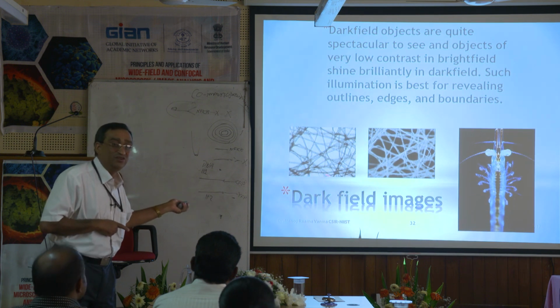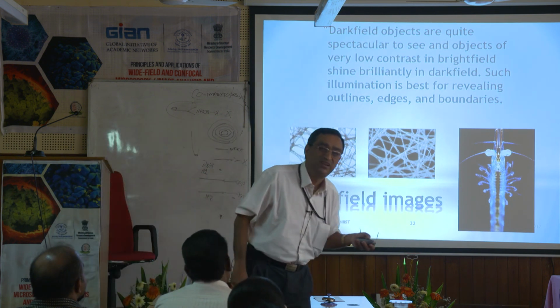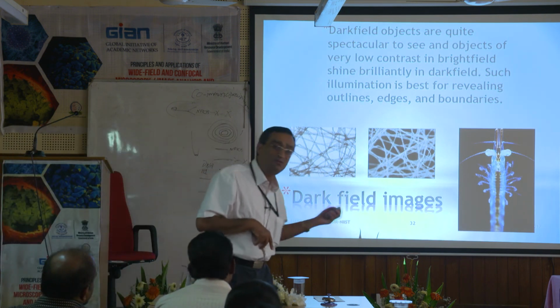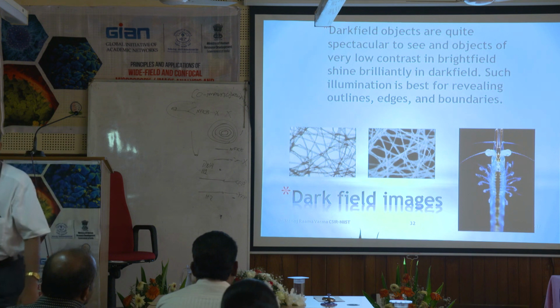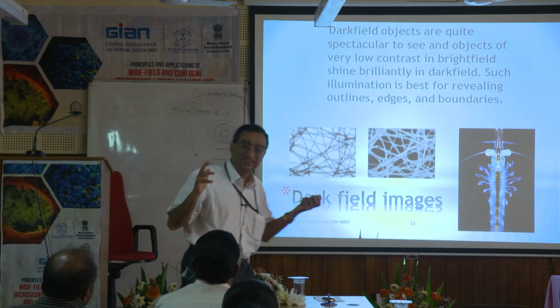Okay, this is very good for you, not for us physicists. We never use dark field, except to view the morphology of crystals. Of course we use it. But dark field microscopy is a wonderful technique where you make the illumination oblique, not direct. And in photography also you use it, isn't it?